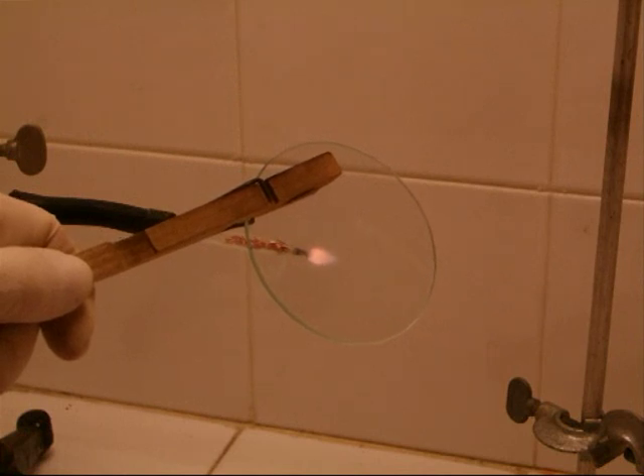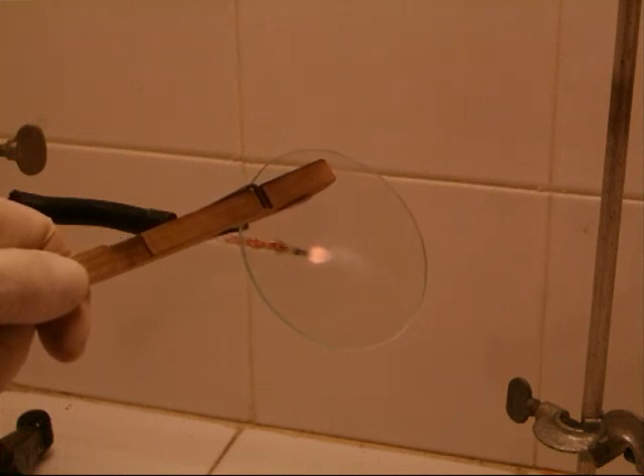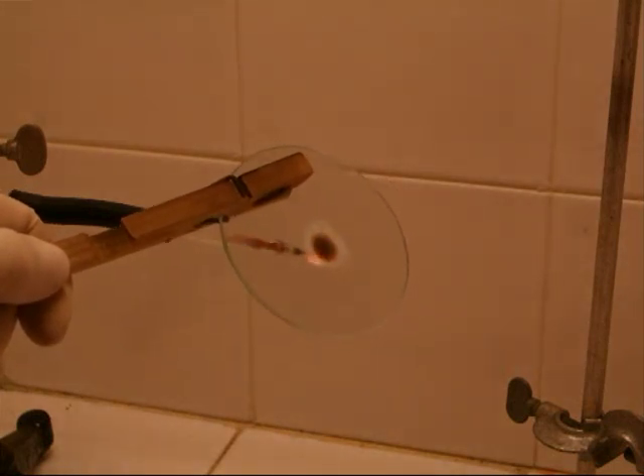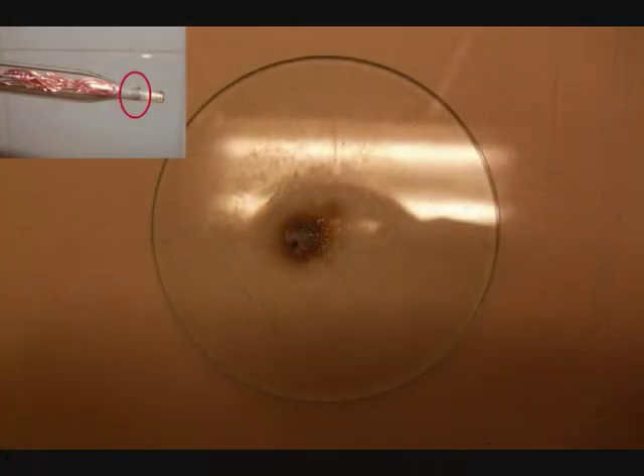Now, a piece of glass is held into the flame. As you can see, a dark precipitate settles down on the glass. This precipitate is pure arsenic. Here you can see the arsenic mirror on the piece of glass. To specify the analysis, a hypochlorite solution can be added to the arsenic mirror. The arsenic mirror will dissolve in it.